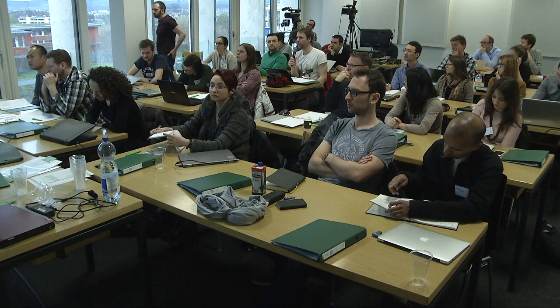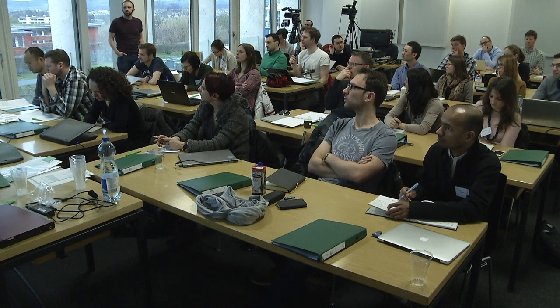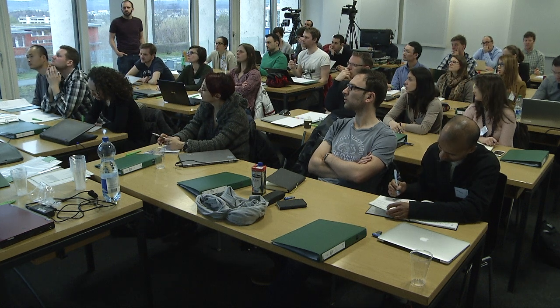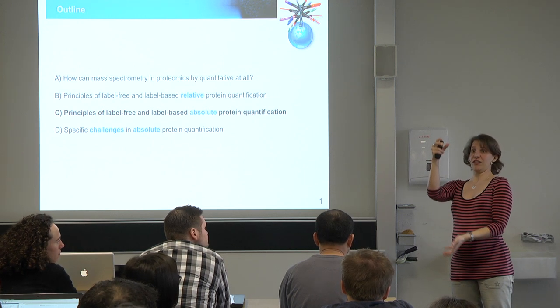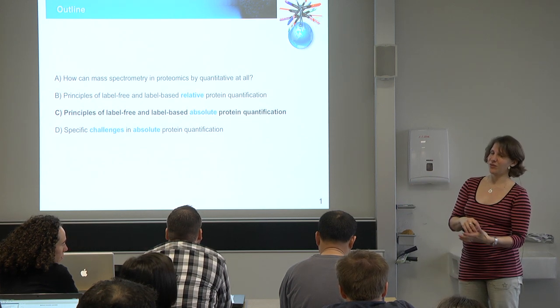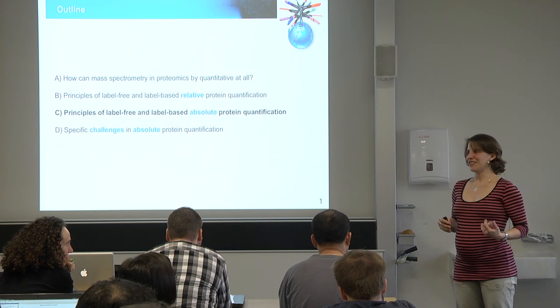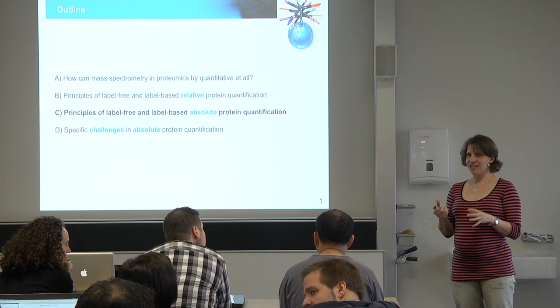You still keep referring to protein even though you work on peptides? Mm-hmm. It's also a very good comment, and you're absolutely right that whenever we want to do protein quantification, we do not only need to combine transition intensities into a final peptide ratio, but we also need to combine peptide ratios into a final protein ratio. And that's actually a bigger issue than combining transition intensities even. And there are various different ways and tools to do that.